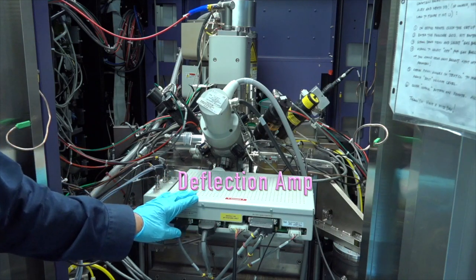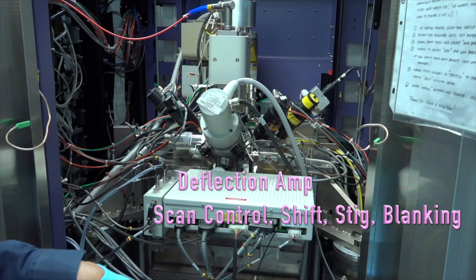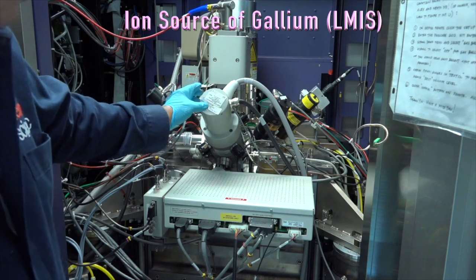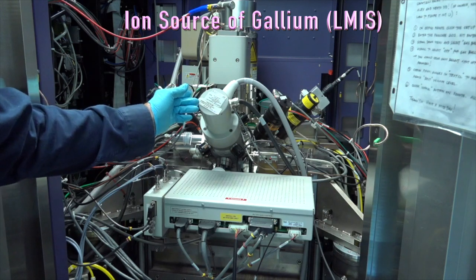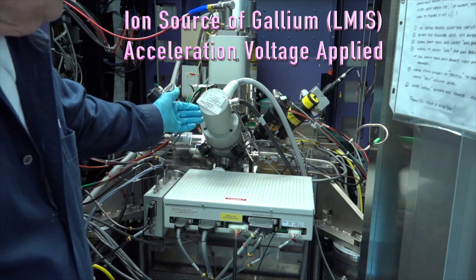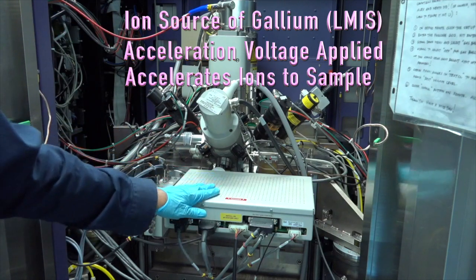This box right here is a deflection amplifier that moves the beam — steers the beam if you will — both when it scans, plus it has a DC shift left, right, up and down. It also helps with the stick, and it's a very important box. Basically, we generate an ion beam from the source — the liquid metal ion source. We accelerate that source and it will begin to emit, and then we control it with this box.